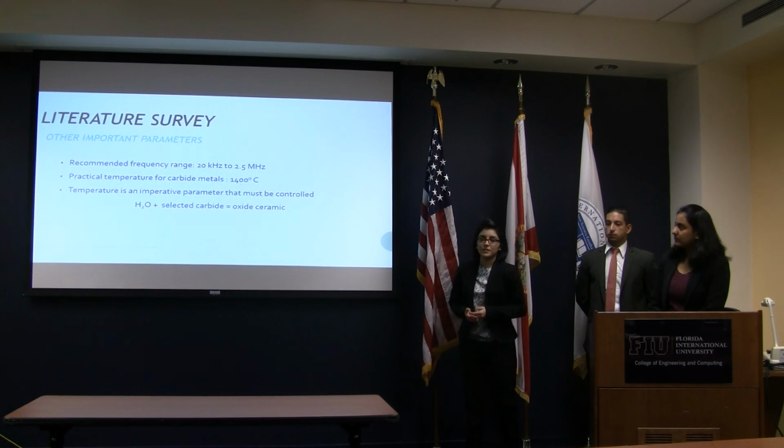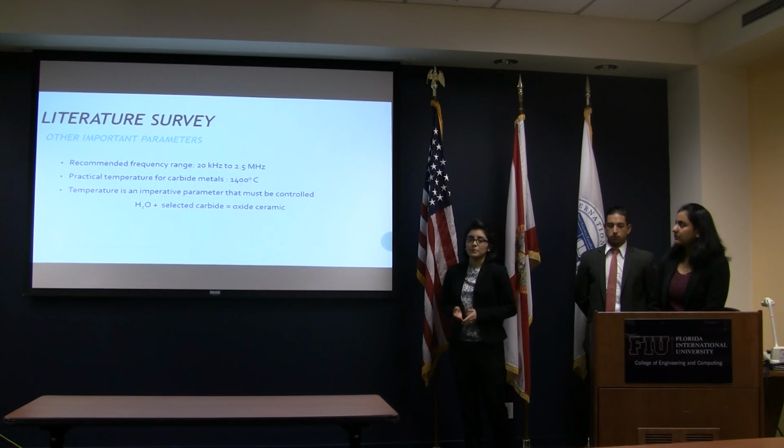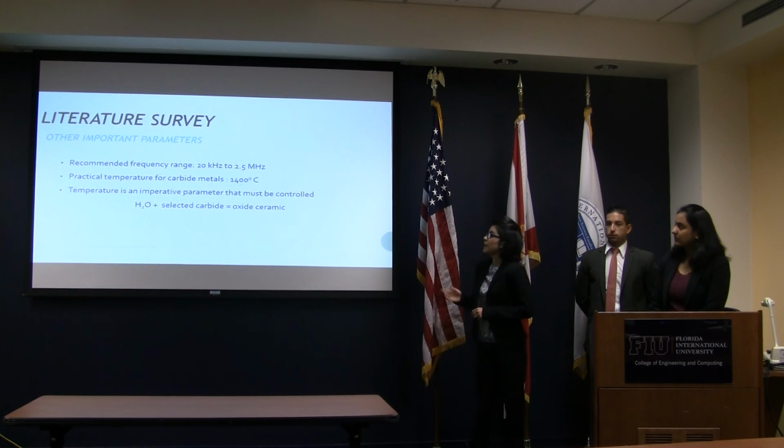There were other parameters that kept showing up through our research. One of them is frequency, which is recommended to be set around 20 kilohertz and 2.5 megahertz. The other one is temperature, which is recommended to be set around 1400 degrees Celsius for carbide metals.